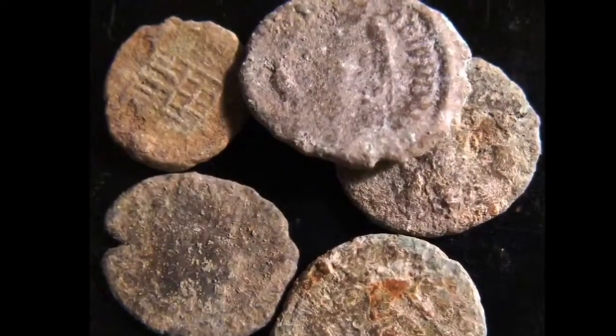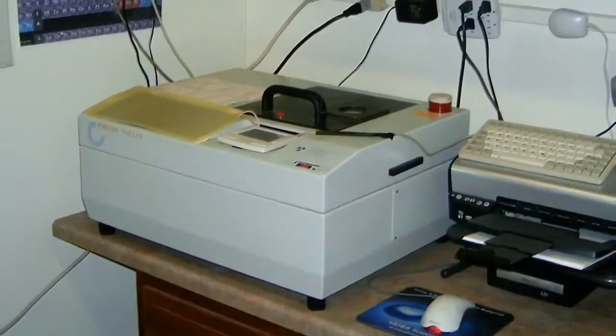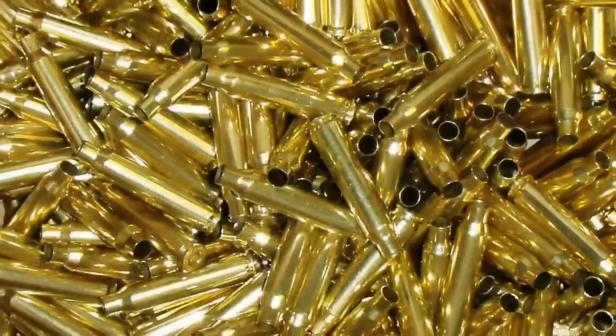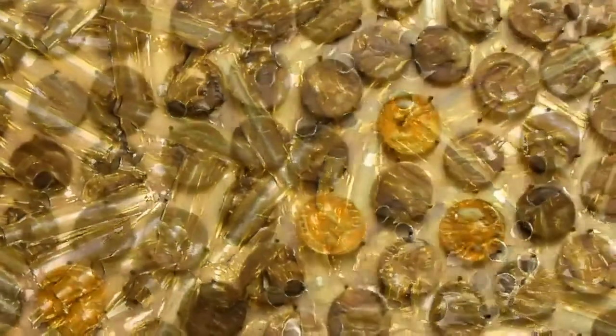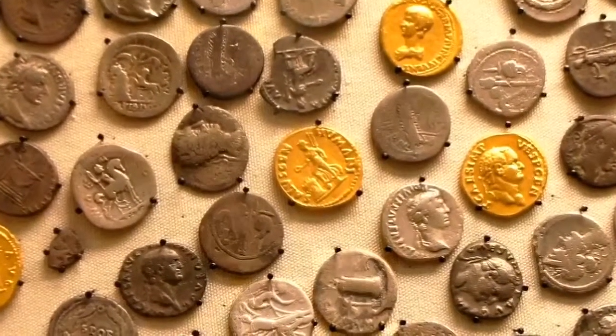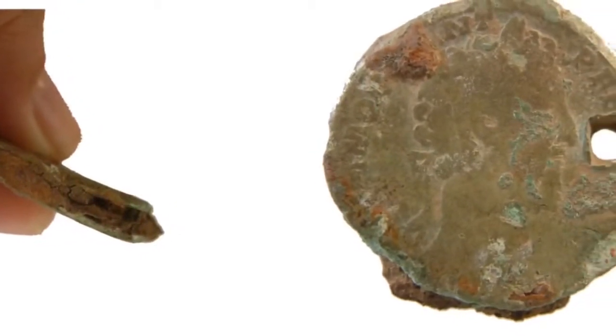This technique is not only exciting and interesting in terms of its possibilities, but it's relatively inexpensive, and it's used on objects all the time. Imagine you have excavated coins which cannot be identified by eye due to corrosion. You pass them through an EDXF machine, and it reveals that part of its constituents are copper and zinc, also known as brass. Believe it or not, brass is not a common metal in the world of ancient coins, and only one group are known to have used it widely. These are the Romans, so chances are that you're holding Roman coins.